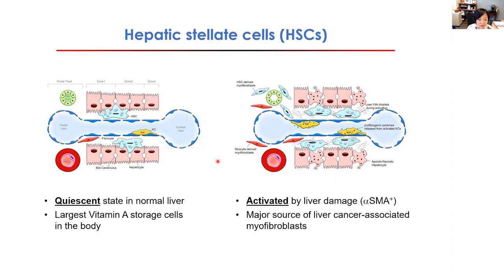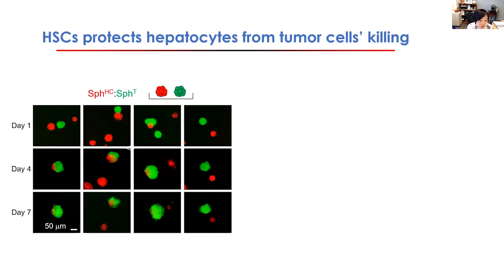So we know now that it looks like hepatic stellate cell activation actually slows down tumorigenesis in our in vitro model. But we are also wondering what they do to the normal compartment. Why do they just sit right at the border? So what we did, first of all, is look at the hepatocyte and tumor interaction, because we noticed that the green fluorescence in our co-culture system expands very quickly, while at the same time the red fluorescence is diminishing. So tumor cells are expanding and hepatocytes are going away. That indicates some type of killing of hepatocytes by tumor cells.